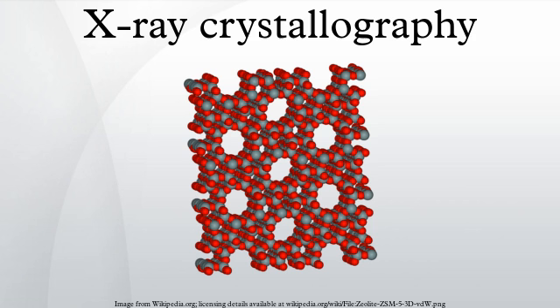By contrast, macromolecular crystallography often involves tens of thousands of atoms in the unit cell. Such crystal structures are generally less well resolved. The atoms and chemical bonds appear as tubes of electron density, rather than as isolated atoms. In general, small molecules are also easier to crystallize than macromolecules. However, X-ray crystallography has proven possible even for viruses with hundreds of thousands of atoms. Though normally X-ray crystallography can only be performed if the sample is in crystal form, new research has been done into sampling non-crystalline forms of samples.